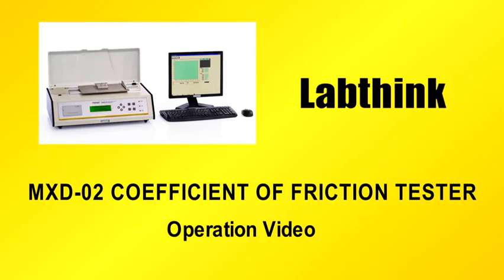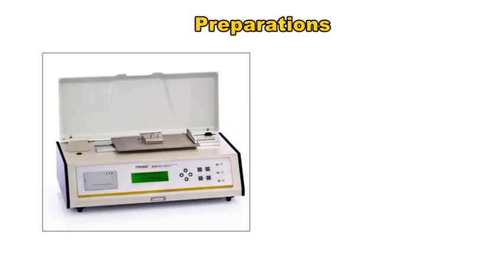MXD-02 Coefficient of Friction Tester. Operation Video. Preparations. MXD-02 Coefficient of Friction Tester.